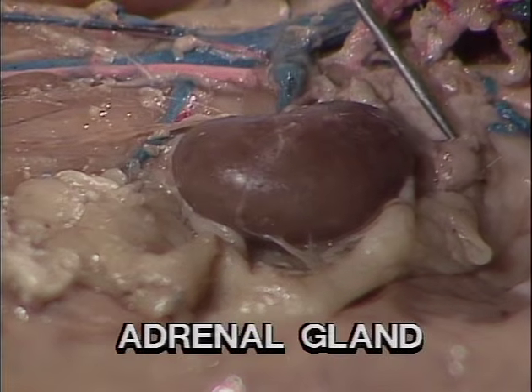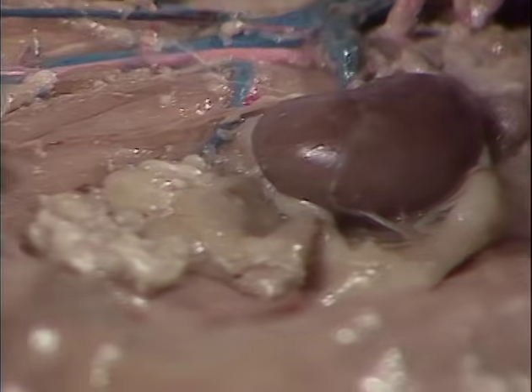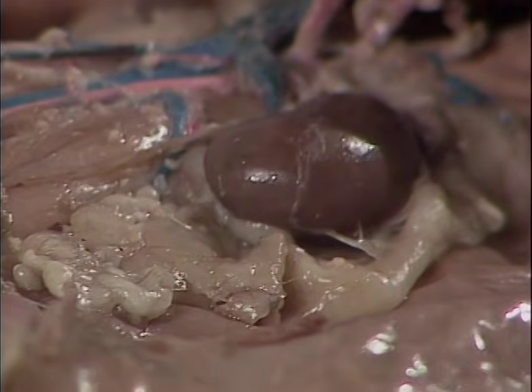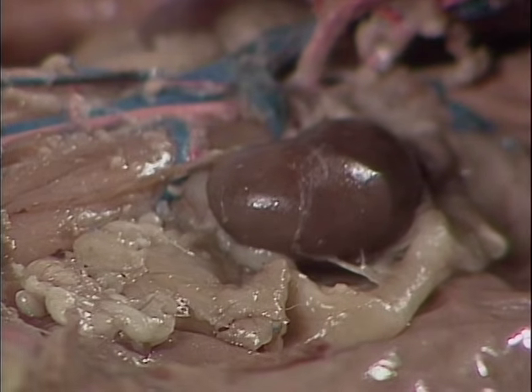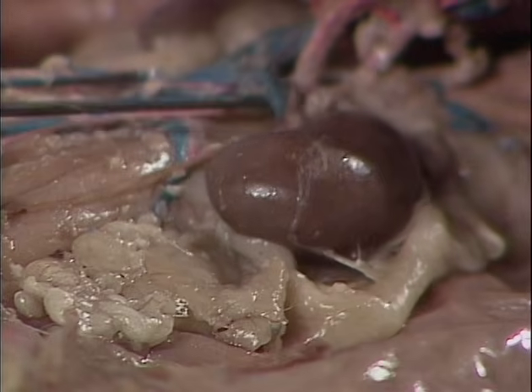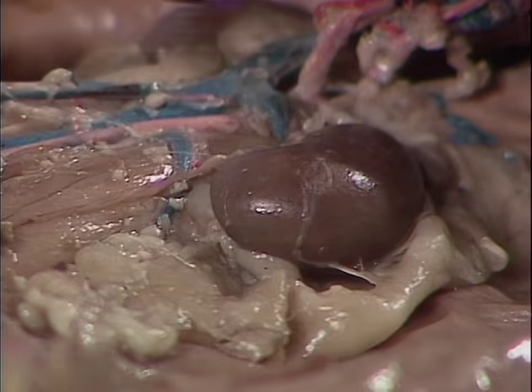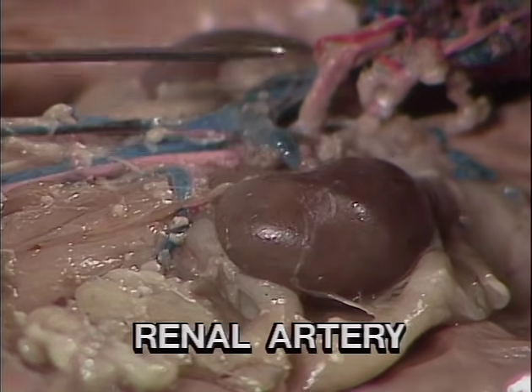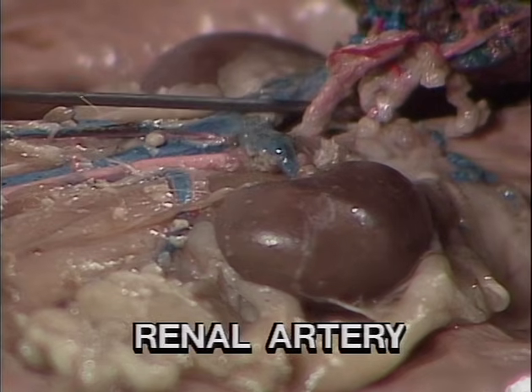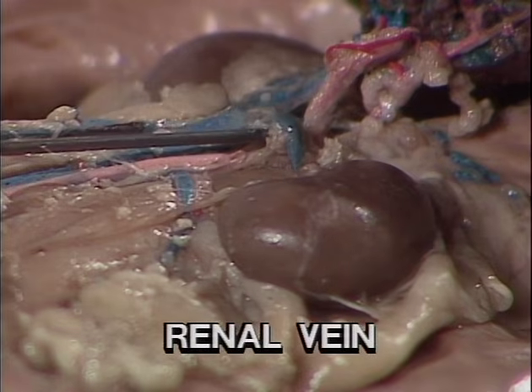Cranial to the kidney is a small round structure known as the adrenal gland. The kidneys are connected to the circulatory system, from which they remove nitrogenous waste, excess water, salt, and other substances. As we look here, we can see 2 colored vessels entering the kidney. The pink vessel is the renal artery. It enters the kidney from the dorsal aorta. Sitting right next to it is a blue vessel, which is the renal vein.